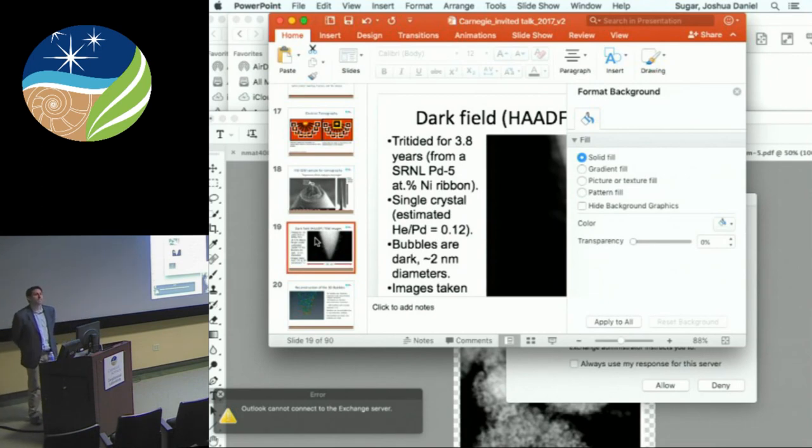I just wonder, how long does it take to collect those 5-micron cube 3D images? With modern detectors, it actually can be very fast. With my old 22-year-old microscope, typically we're looking at anywhere from 45 minutes to a couple hours. But with the new microscope, things are very advanced today. It's changed a lot in the last 5 to 10 years, actually.